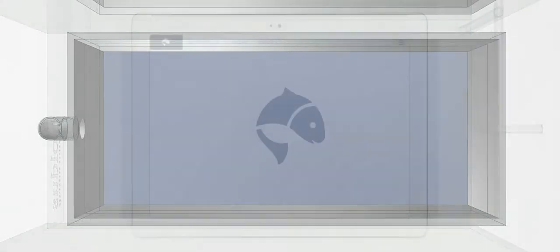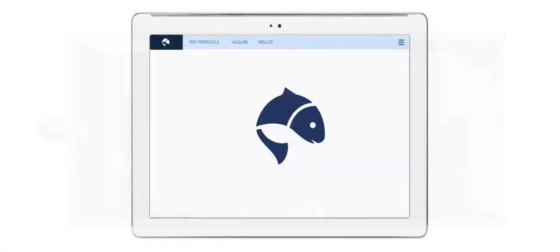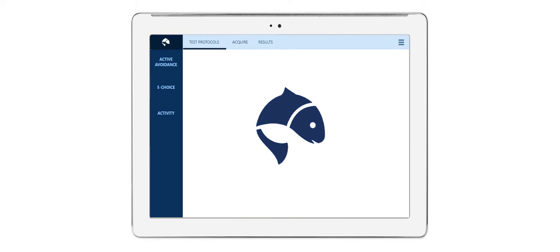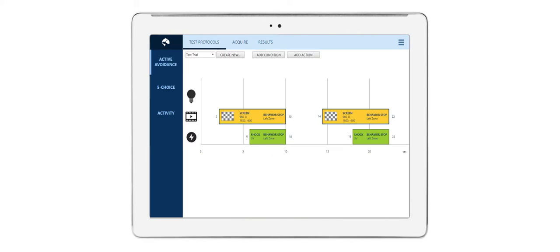With the browser-based software, you can design your test protocol. For example, for an active avoidance test, you can easily adjust trigger times, shock intensity, and the image to be displayed on the bottom of the tank, such as an object, color, predator fish, or in this case, a checkered pattern.